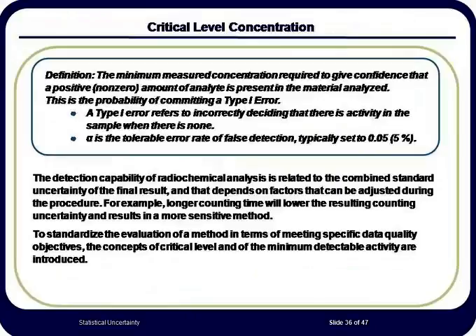If you recall the shape of the Gaussian distribution, the ends were asymptotic to the x-axis. What that meant was that as you get farther away from the mean value, you get less and less likely to make a measurement that is representative of that distribution of values. When we make radioactivity measurements and expect zero as the result of that measurement, it also means that there is the probability of getting high values that could be considered true activity. We need to determine at what point above the mean concentration we say that we have true activity in the sample that is not zero.